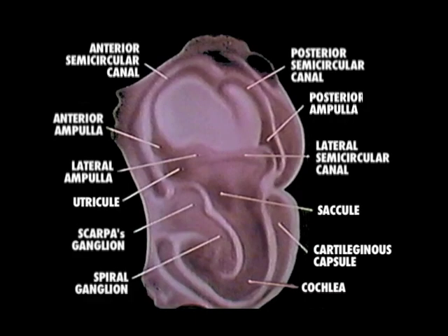These time-lapse studies have shown the extracorporal growth of the 12-day otocyst for 7 days. The inner ear has developed from a simple sac consisting of a dorsal portion, a ventral portion, a statoacoustic ganglion complex, and an endolymphatic projection into a complete membranous labyrinth with a surrounding cartilaginous capsule. In cultures which have been grown for 10 days, the final stage is comparable to what the inner ear of the mouse would be like at birth.